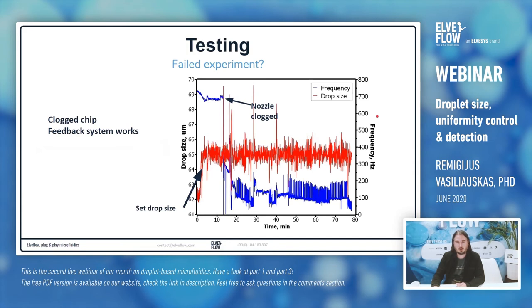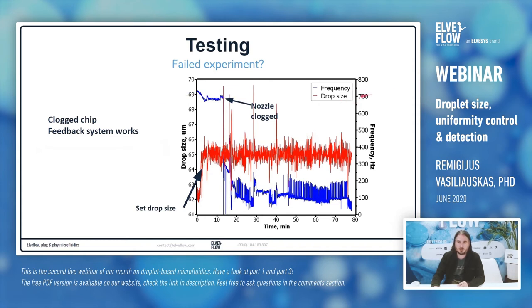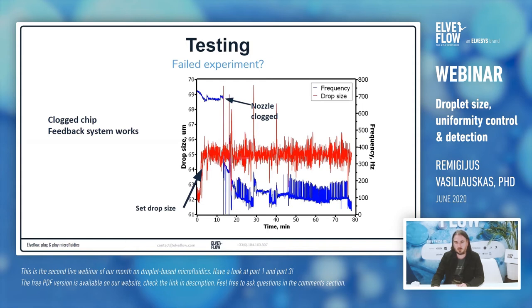I wanted to show a kind of failed experiment where our system was still working. We start at 700 Hz droplet production at 63 micrometers droplet size. We turn on the feedback system and it goes to 65 micrometer droplets. Then at a certain point, the chip is partially clogged — the frequency of droplets drops significantly to about 100 Hz. But the droplet size is kept quite uniform by the feedback system. The system struggles but still works nicely.